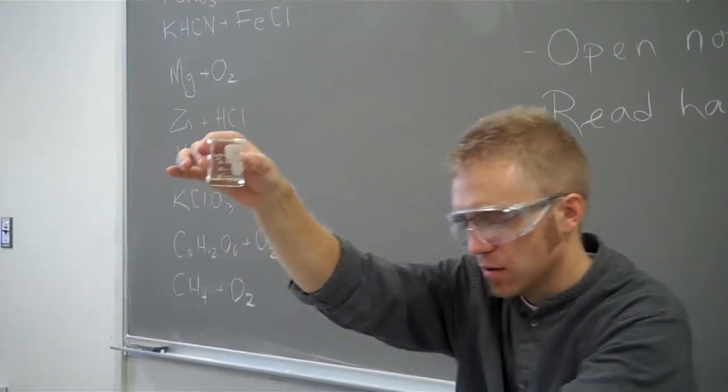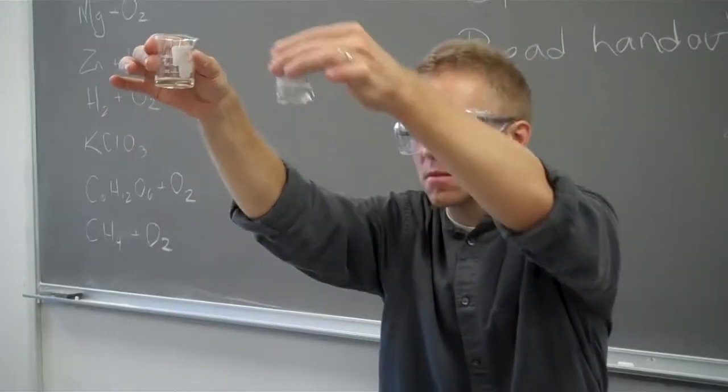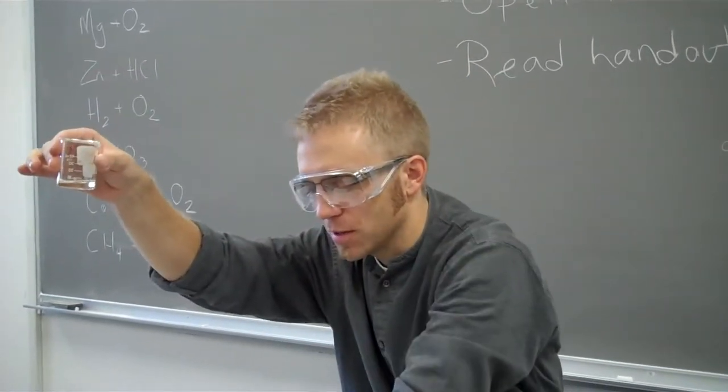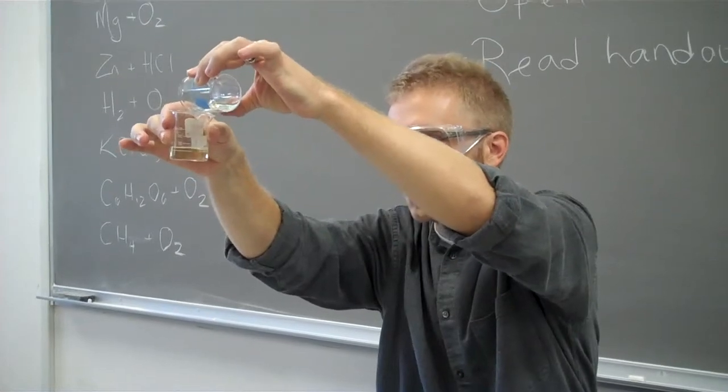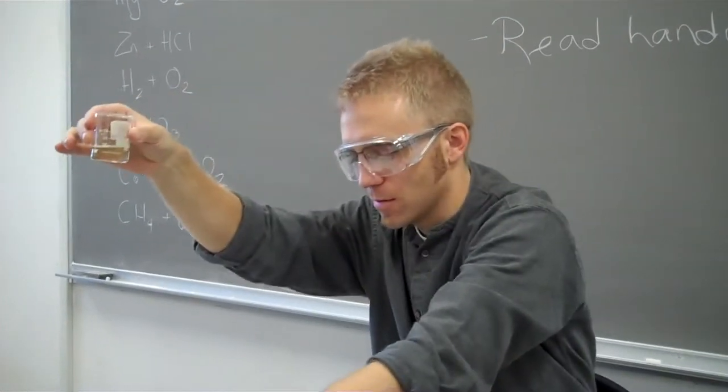And then, the lead nitrate. Well, let's put a little bit more sodium iodide in it. There's so much here. Might as well fill it up. Ready?